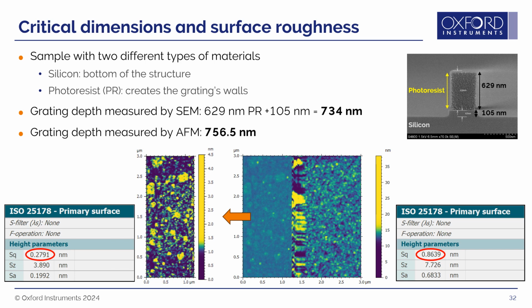This example shows the advantage of AFM characterization over SEM, as only AFM can provide direct measurements of both critical dimensions and quantitative surface roughness. One last thing about surface roughness measurements. Here we focused on the bottom of the trenches and the top of the ridges. However, there is also a lot of interest about sidewall roughness.